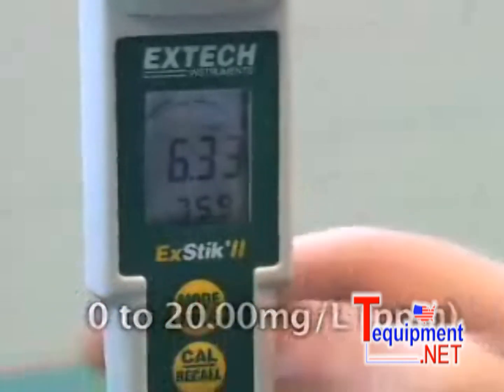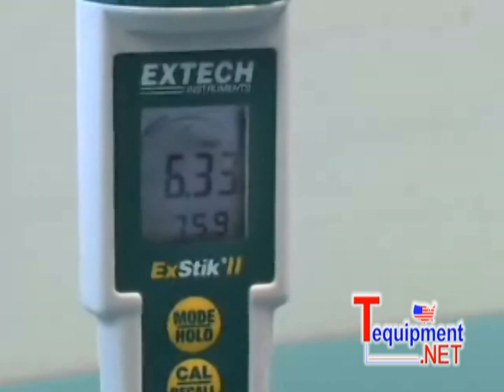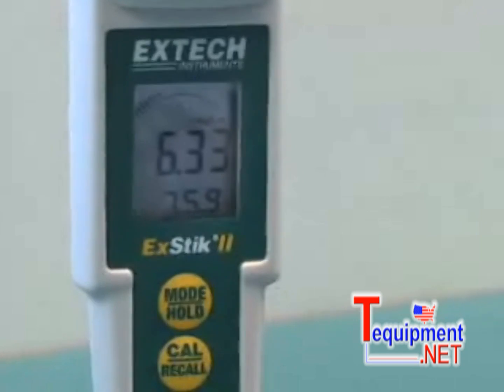It also displays the temperature and an analog bar graph that shows you the trend of oxygen level when measured at different depths.